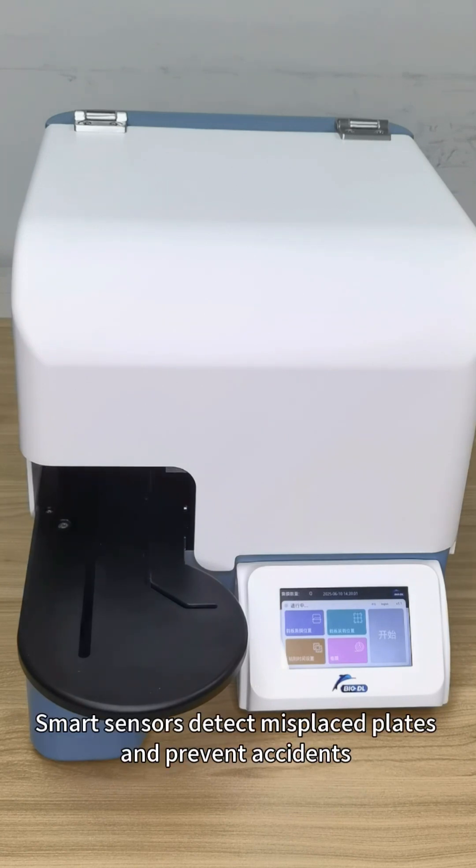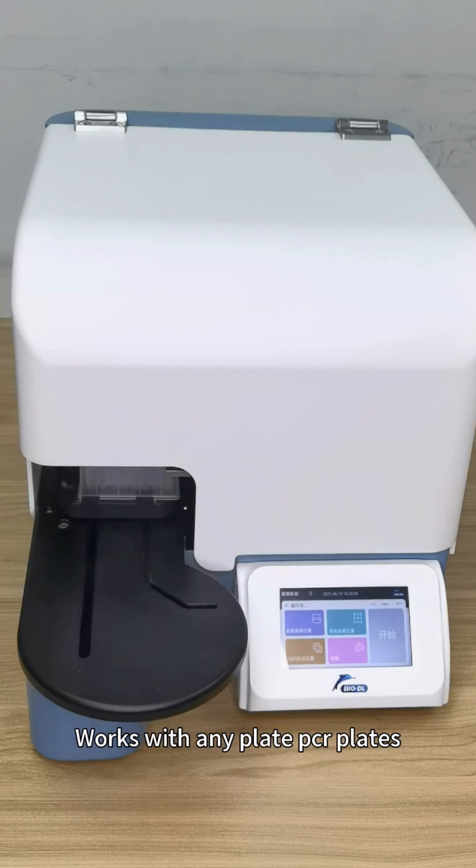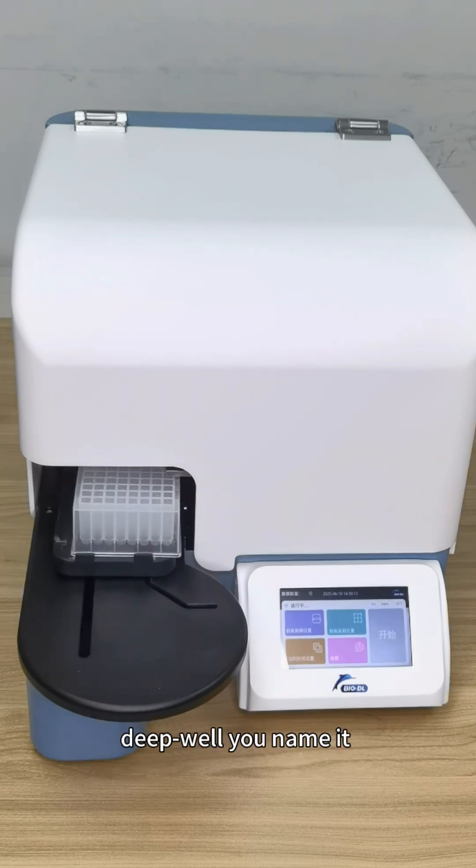Zero errors. Smart sensors detect misplaced plates and prevent accidents. Works with any plate, PCR plates, deep well, you name it.